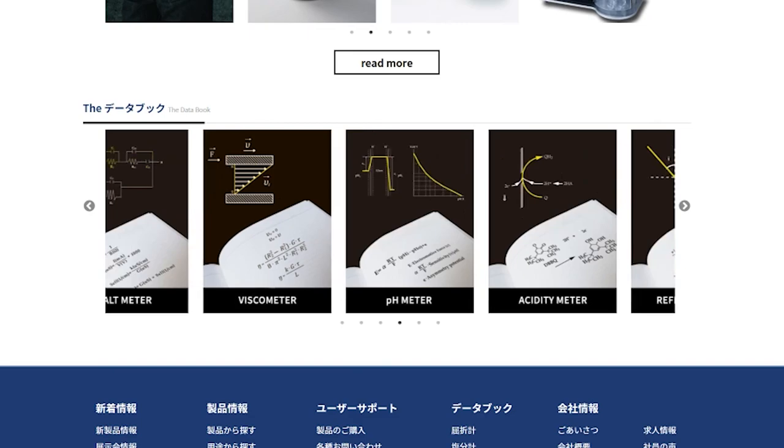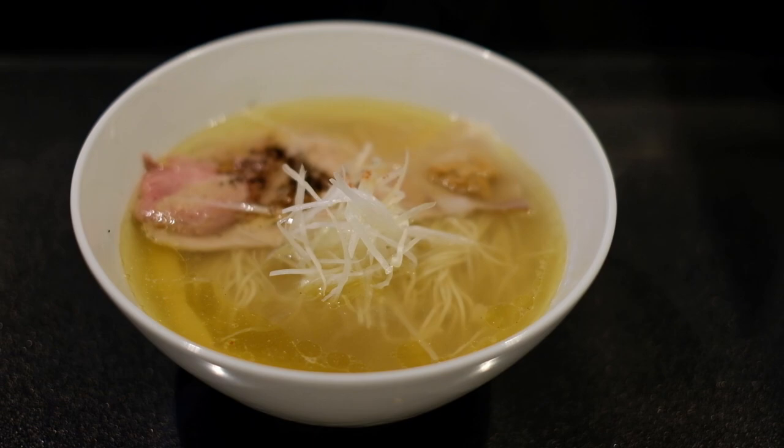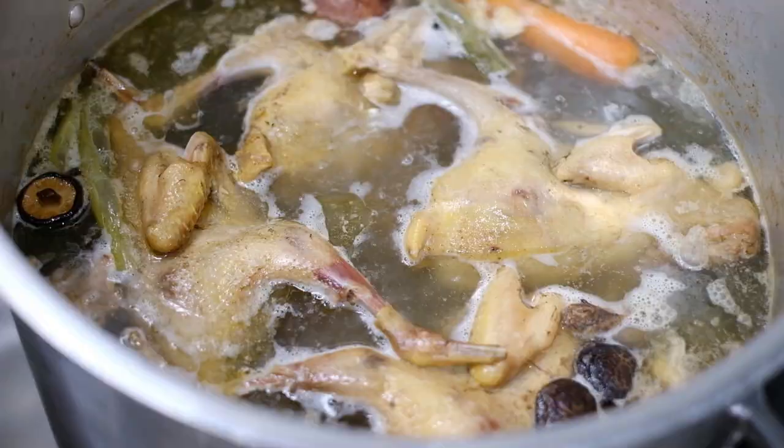With my new digital pocket brix salt meter, it's all done on one unit. I just came here to see delicious ramen — what's with the science lesson? Well, delicious ramen is a combination of intense, meaty soup and a perfectly salty impact. Ramen chefs strive for consistency with these two factors, and subtle changes can ruin a great bowl.